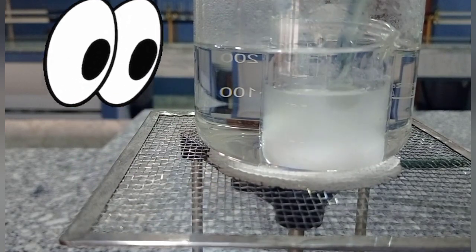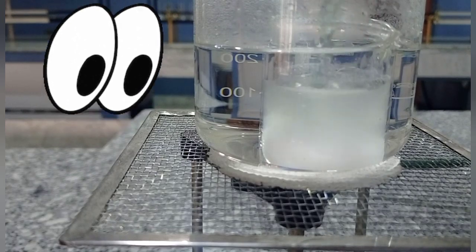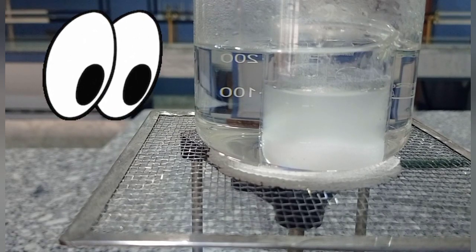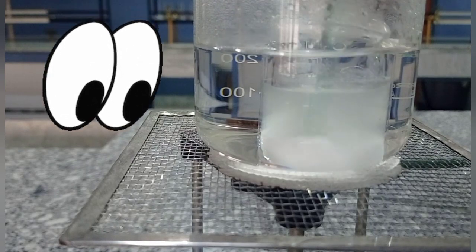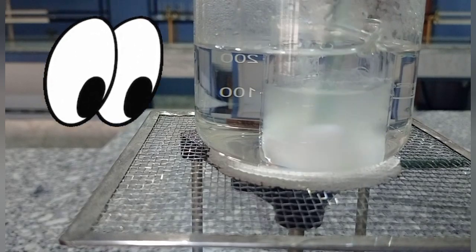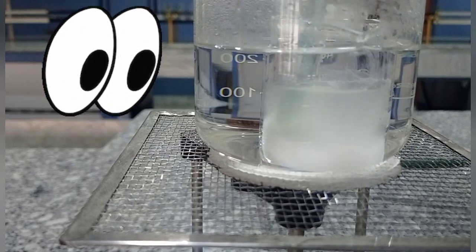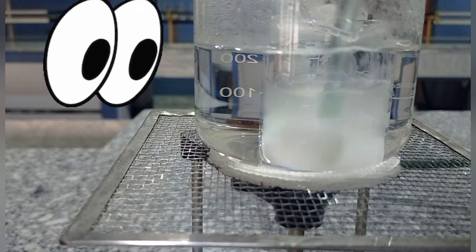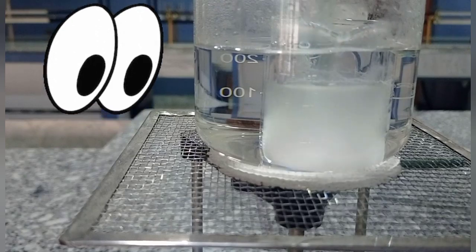salt solution. My dear students, you can see that as the temperature of this solution is increasing, more and more amount of salt is getting dissolved. You see, more and more amount of salt is getting dissolved. So I'll continue to stir. Let the temperature increase gradually. I will continue to stir.